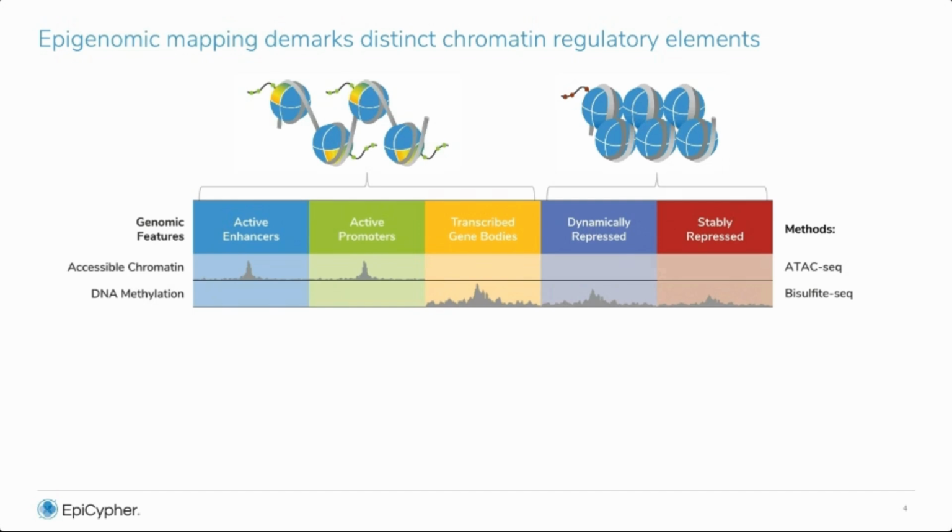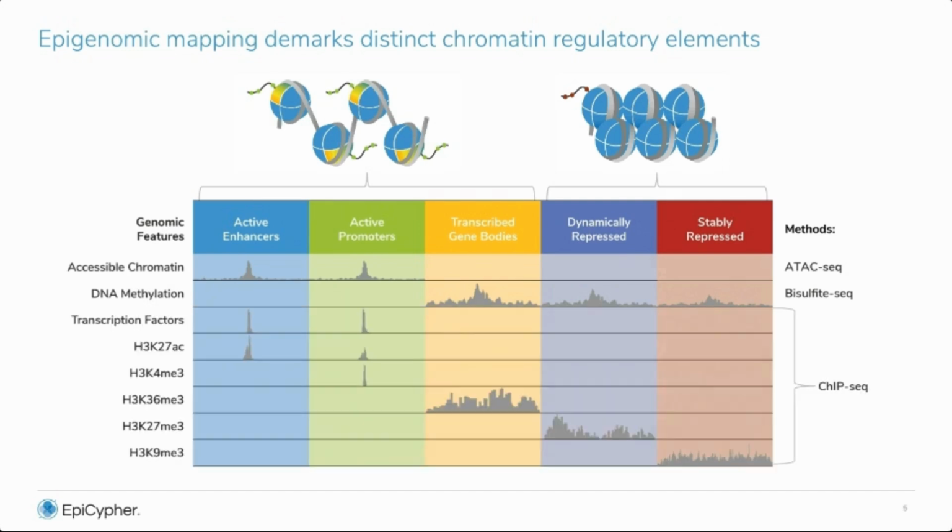So there's either some other factor here that's blocking transcription, or there's something that's missing that's not promoting active transcription. And in the case of bisulfite sequencing, looking at DNA methylation, this is commonly associated with repressed regions of chromatin. However, you can actually find a large amount of methylated DNA in active gene bodies. So again, it's not as black and white as it would seem to be.